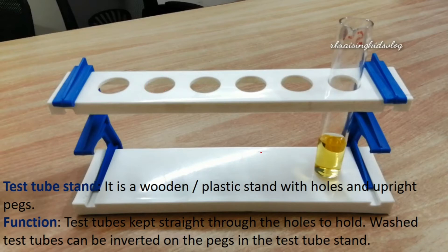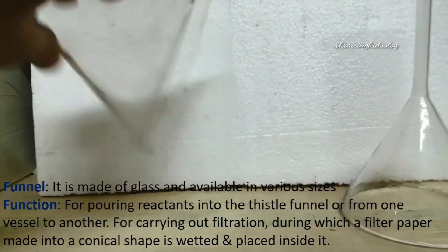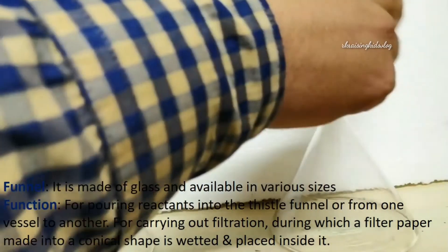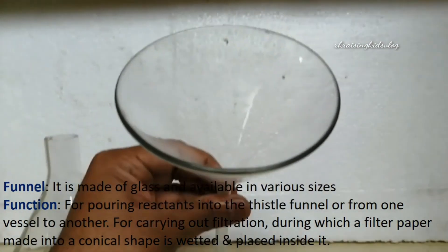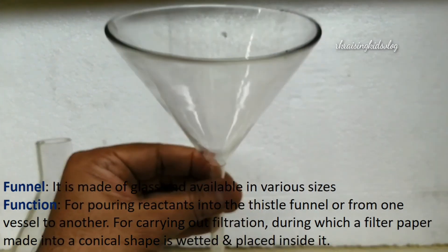Next, we'll know about the funnel. This is made of glass and available in various sizes. It is used for pouring reactants into test tubes or from one vessel to another. It is also used for carrying out the process of filtration, during which a filter paper made into a conical shape is wetted and placed inside it. The filter paper catches particles and the liquid gets filtered.